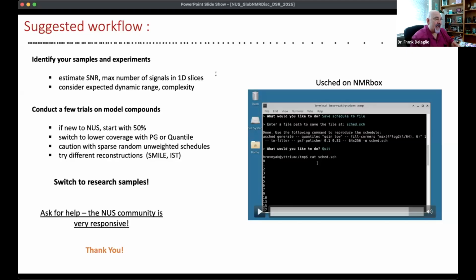Now, if you add two different non-uniformly sampled spectra or time domain data sets, that's completely fine to do, but you'll get a new sampling schedule that corresponds to that, right? And there may be certain cases where the same increment was measured in both of those schedules. That's perfectly fine, but you also have to account for it when you convert and process the data.